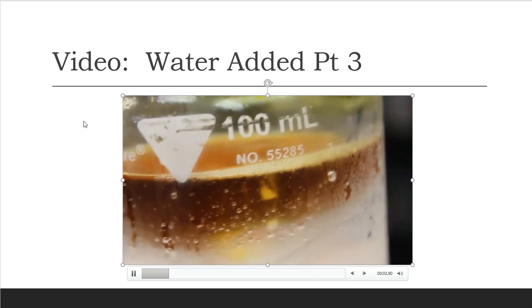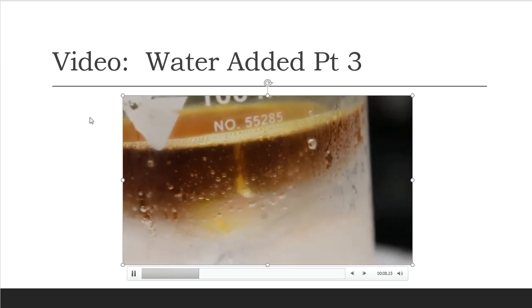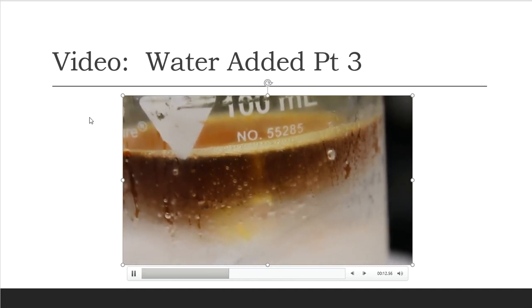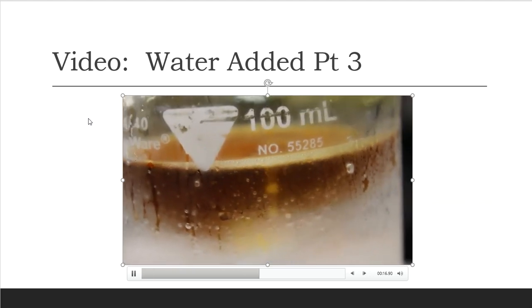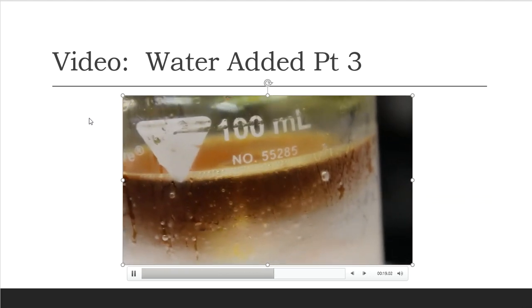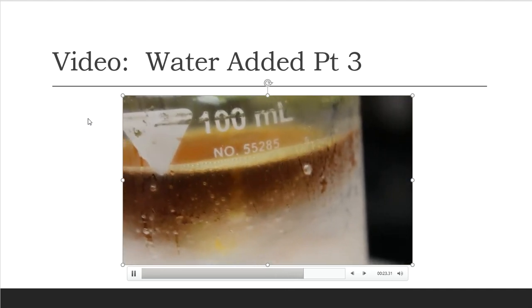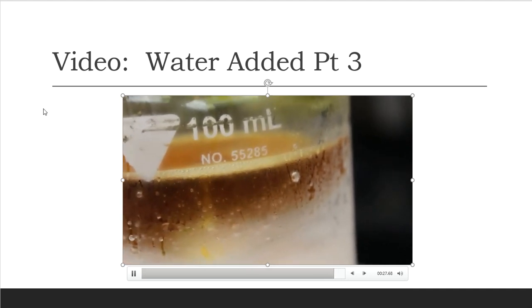Okay, so I'm on this side of the flask. I think you maybe can see what's happening a little bit better over here. So once more, make your observational changes. This is still the addition of water. I'm still at that point. So it's going to tell me to sit this for 15 minutes undisturbed, and my time starts now. So again, more observational changes that you're seeing right there, front person view.